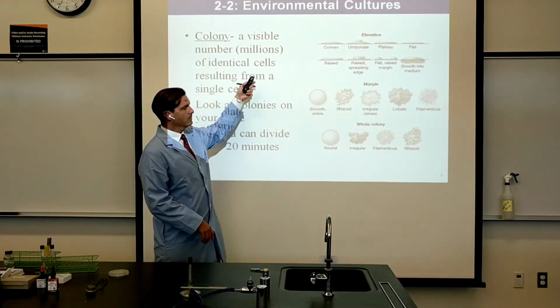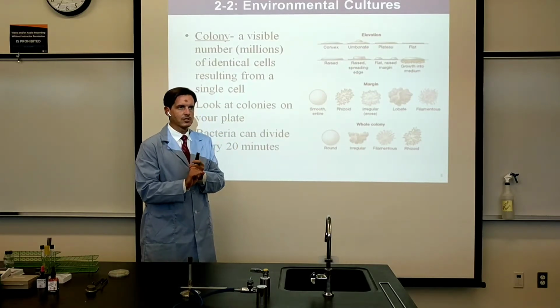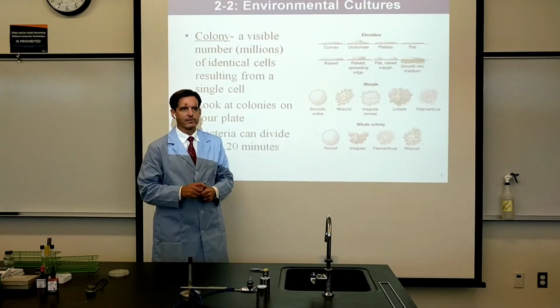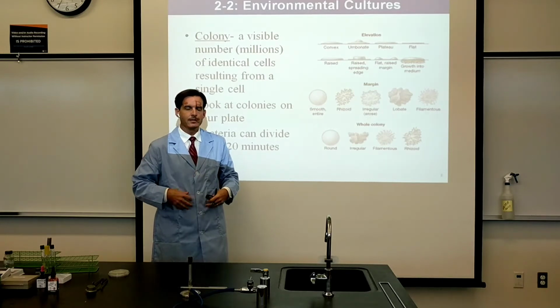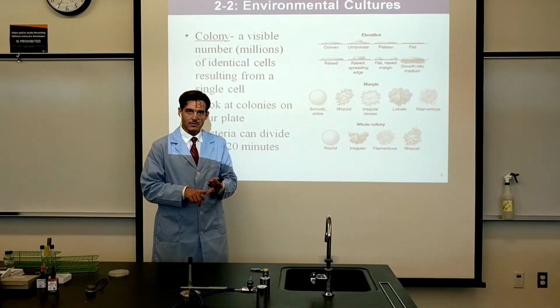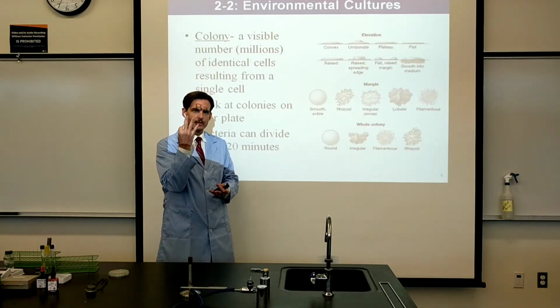So let's do a little math exercise. If one bacterium takes 20 minutes to double, that's pretty average. So staph, like that little yellow colony, is probably a staph skin type of bacterium, or E. coli, ordinary gut bacteria, doubling about once every 20 minutes under ideal conditions, where they have plenty of food and space to grow and 37 degrees warmth, human body temperature, where they grow fastest. That means they can multiply 3 times an hour.